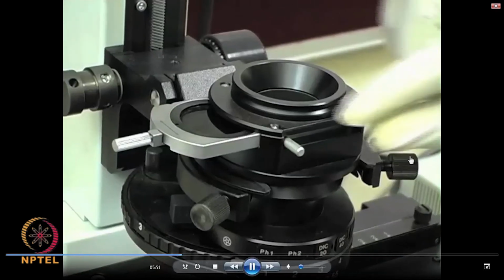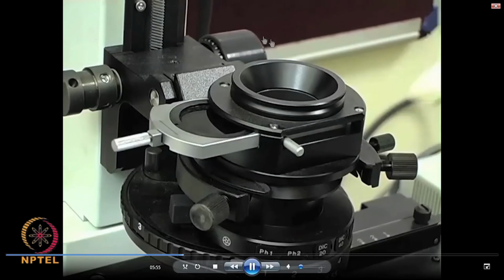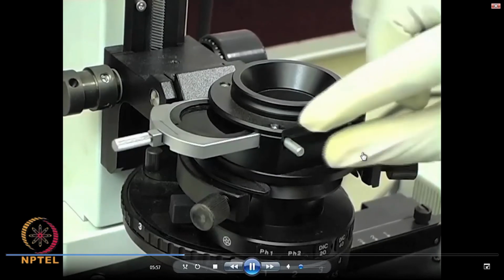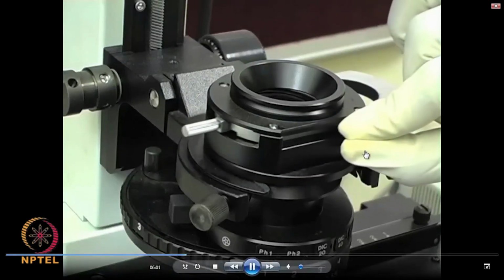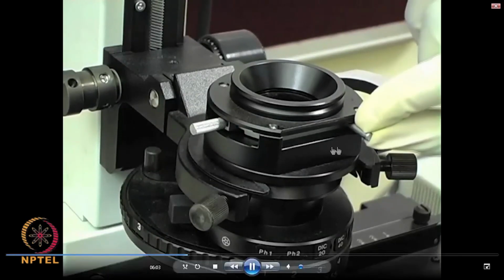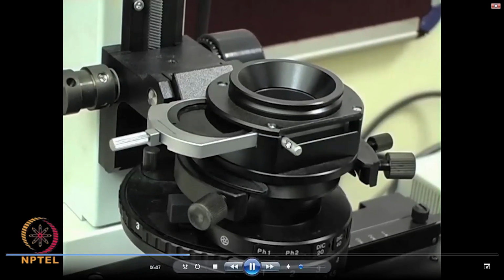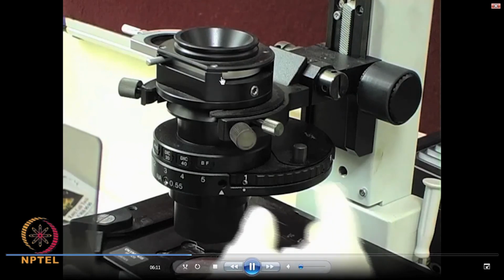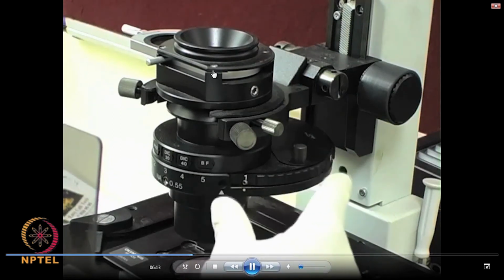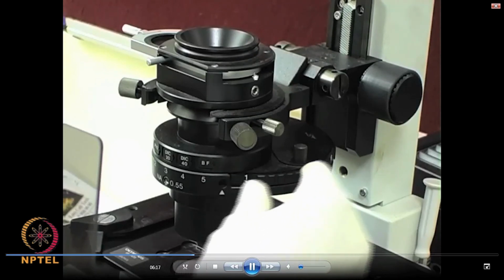I will describe these microscope parts so that you become familiar with the important things you need to understand. What is shown here is a polarizer, and when you do not use the polarizing mode, it is a slot for bright field mode.